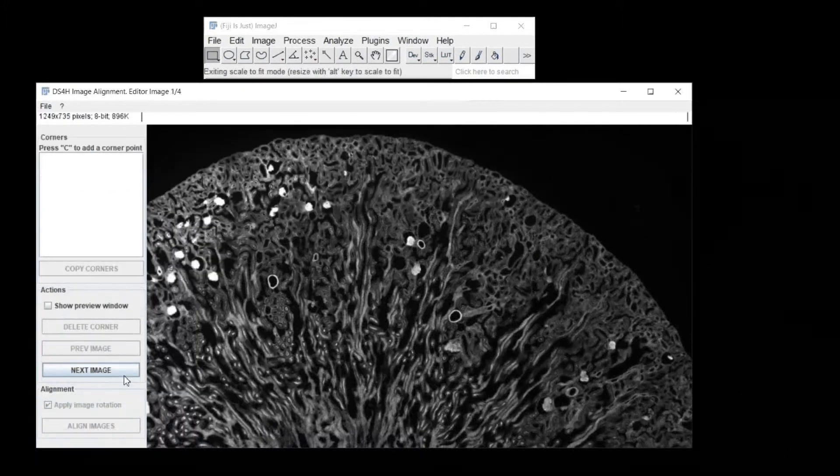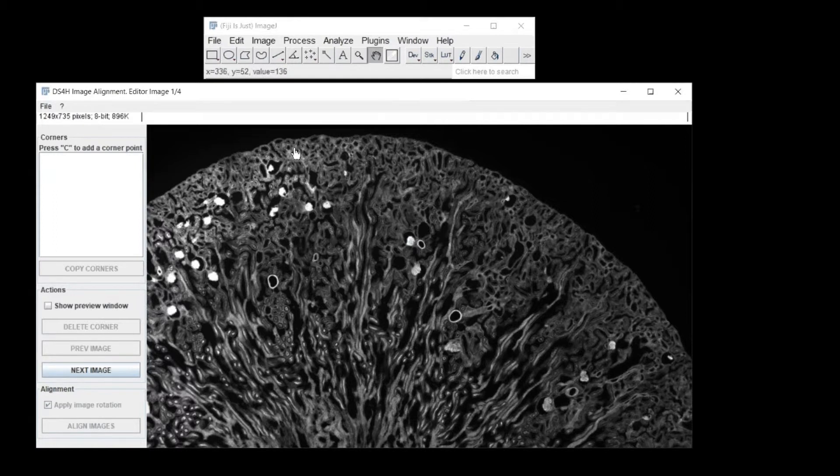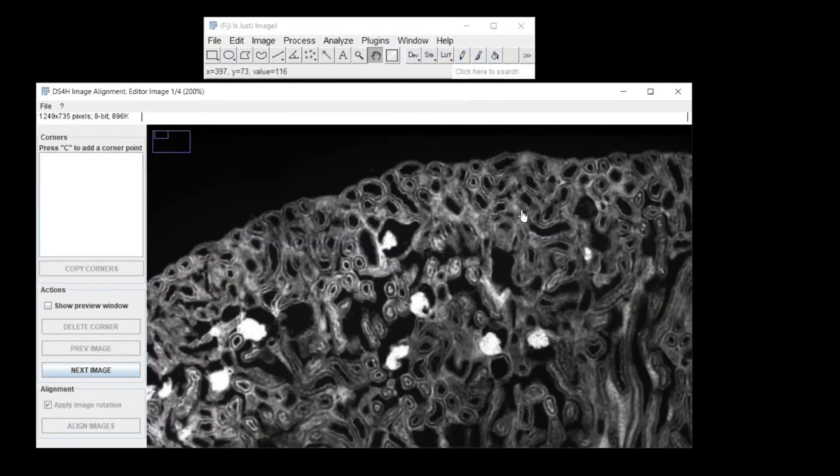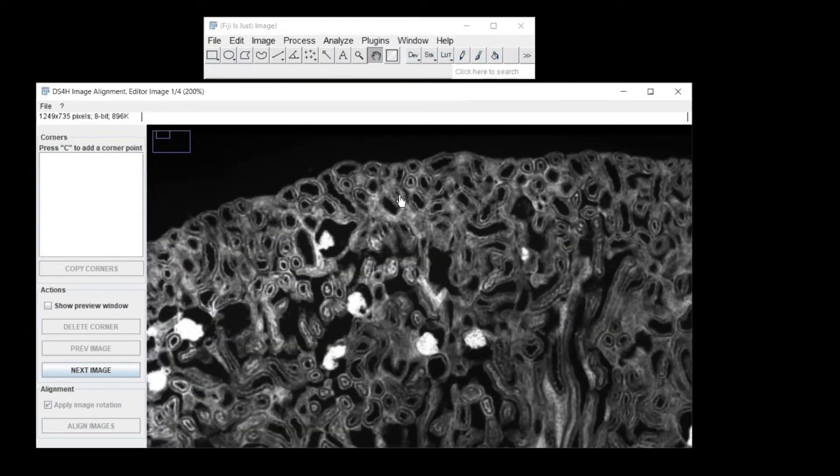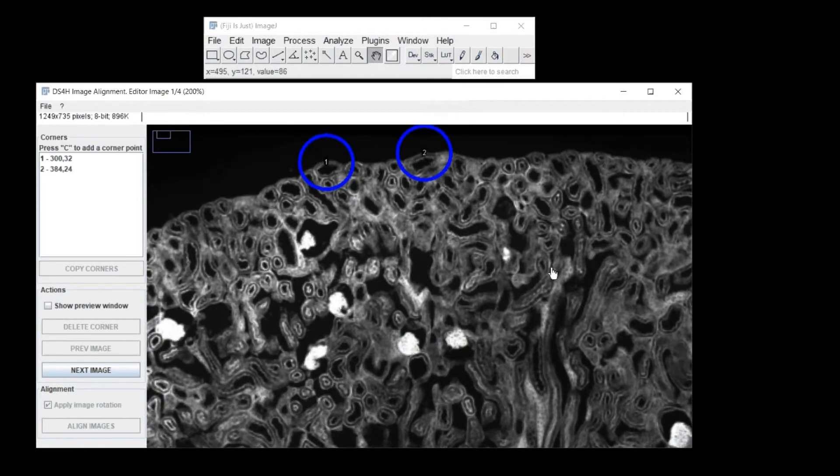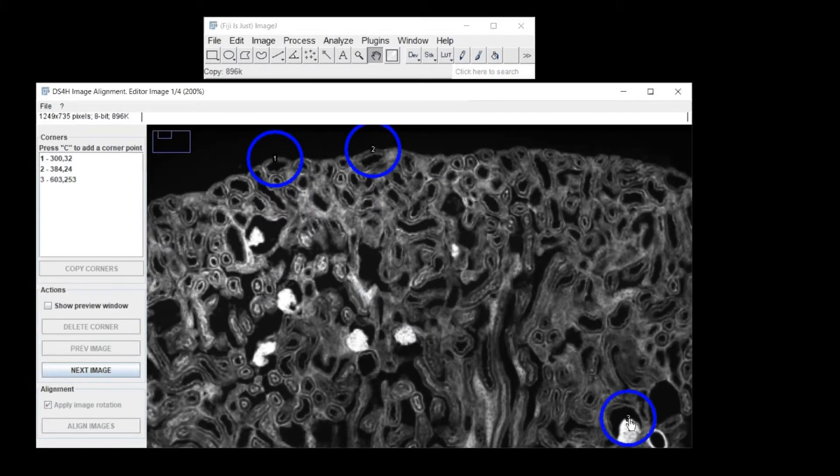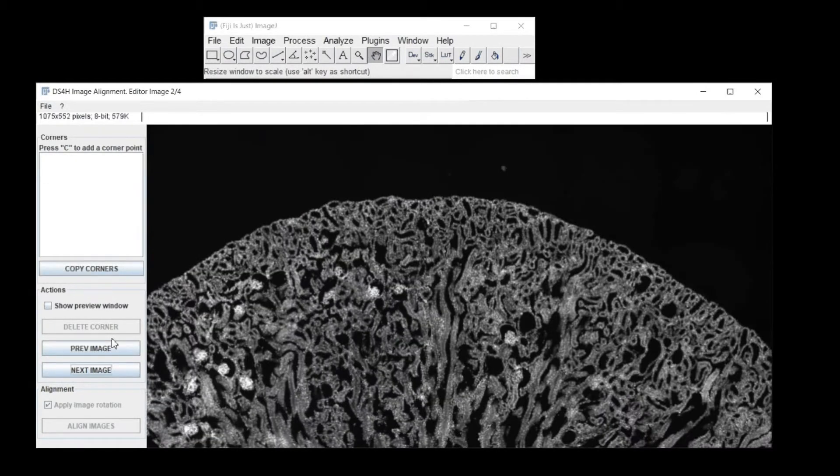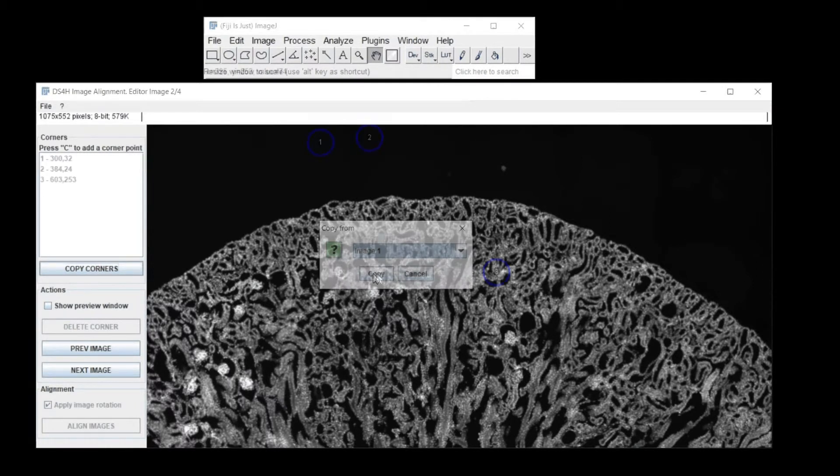All the classical buttons of ImageJ and Fiji are working with the Image Alignment plugin. So you can analyze your images using the plus and minus buttons to zoom in and out, and the small hand to drag the images. This will help you to define at least three corners in each image.